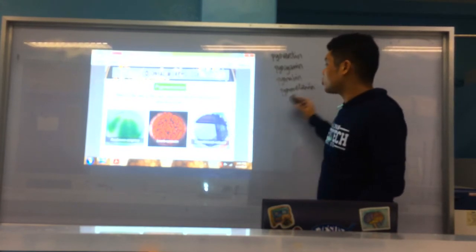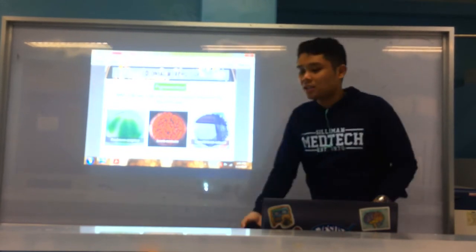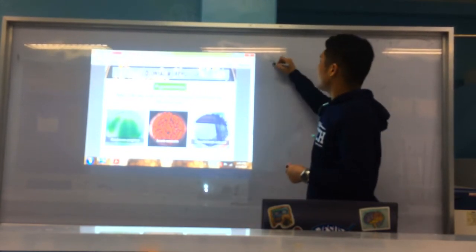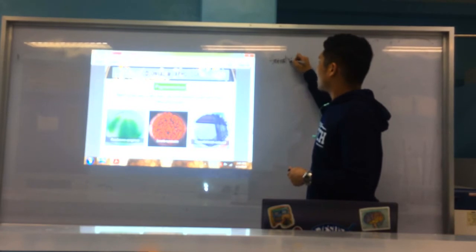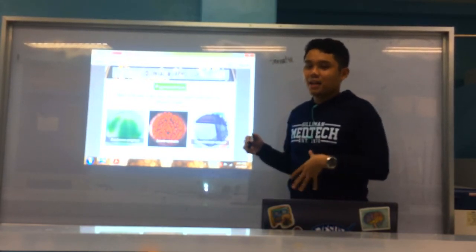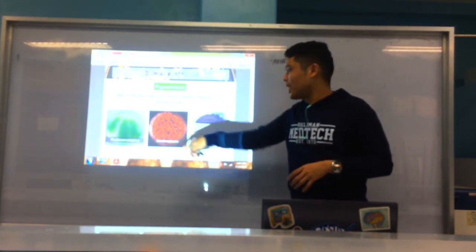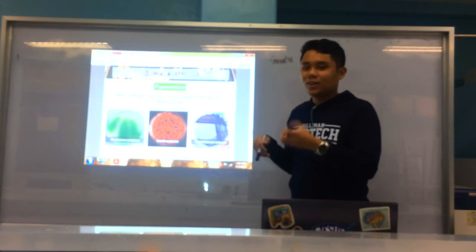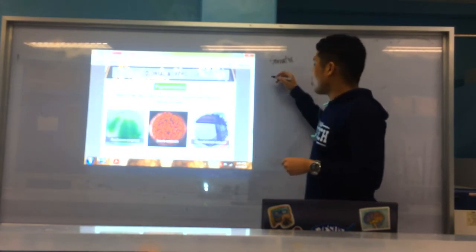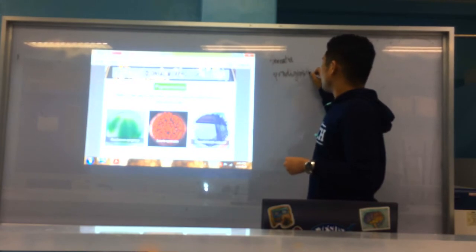That's Pseudomonas aeruginosa. Another organism well known to produce a pigment is Serratia marcescens. Serratia marcescens is a gram-negative bacillus and an Enterobacteriaceae, meaning it belongs to your enterics. It produces red, and the name of the pigment is prodigiosin.